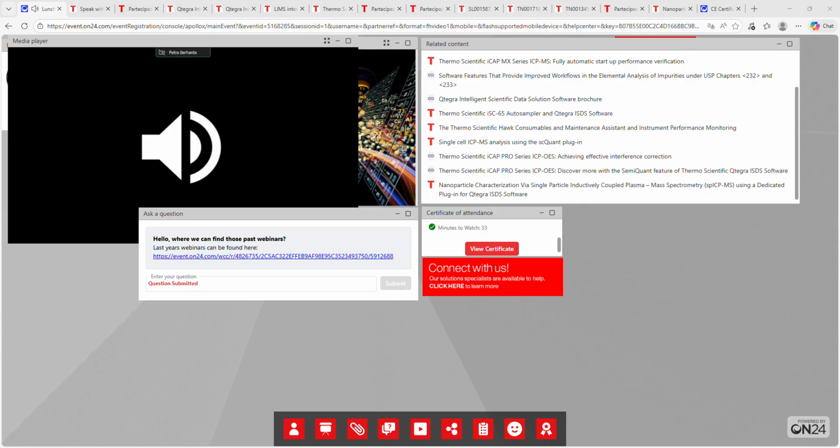Thank you for doing this. When setting a calibration, how do you decide on the best fit type and whether to apply weighting? Okay. Generally, we want to have a linear calibration. That's our ideal situation. We want to set everything to linear where we can.